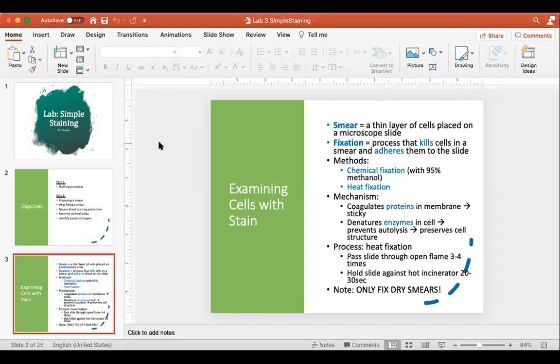But the other thing you are doing is denaturing or destroying a specific kind of protein called enzymes. Remember, enzymes are what do all of the metabolic reactions inside of a cell. When you denature enzymes, you prevent them from doing their normal work, just like if you took a piece of, let's say, chicken breast and you cooked it, you're denaturing it, you're changing it. And when you denature these enzymes inside of microbial cells, you basically inactivate them.